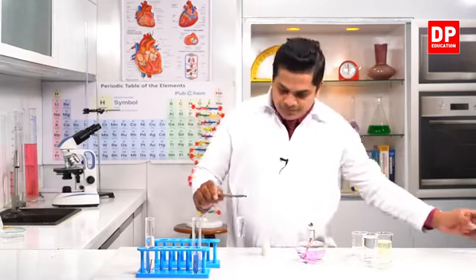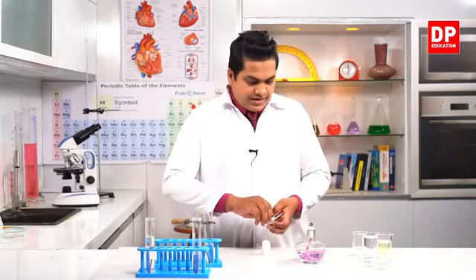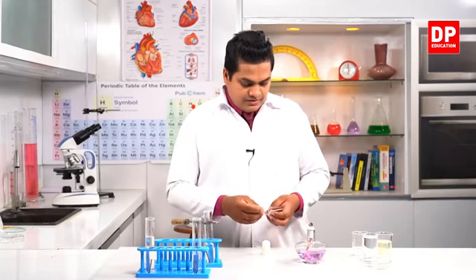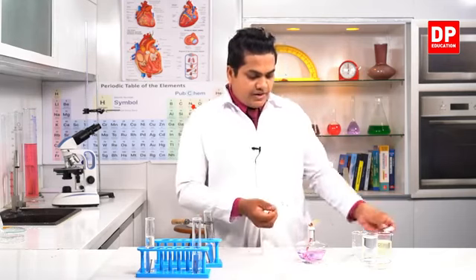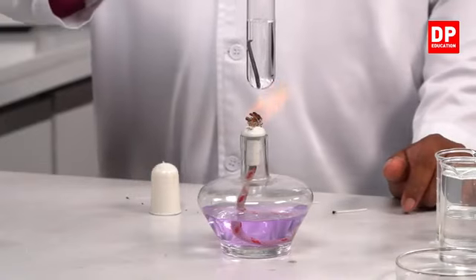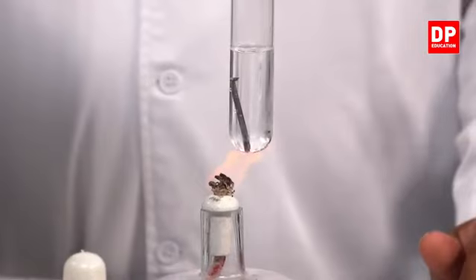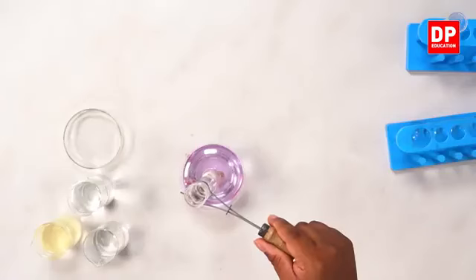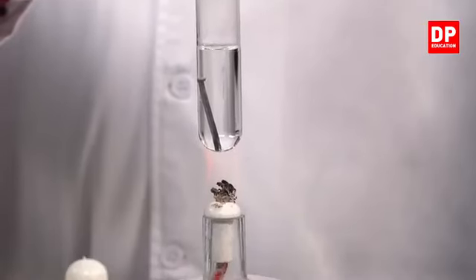Right. So keep it in here. Let's light up the spirit lamp and we'll boil the tube until the water boils and evaporates all the gases in it. Give it some time to boil the water. It's important to boil the water very well to evaporate all the gases dissolved in it.